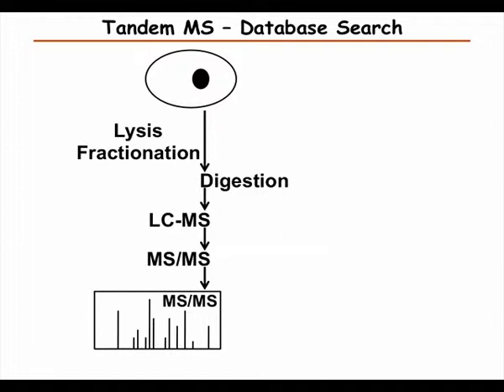But only a very small subset of that is actually used, especially if you know which species it is. If you, let's say, only search human proteins, it's only a few 100,000 peptides that are used out of this enormous space. So that's why the database search is so much easier and much more automatable also.